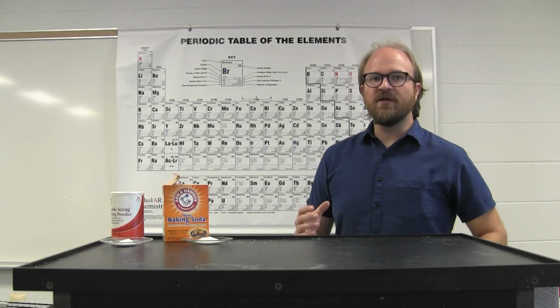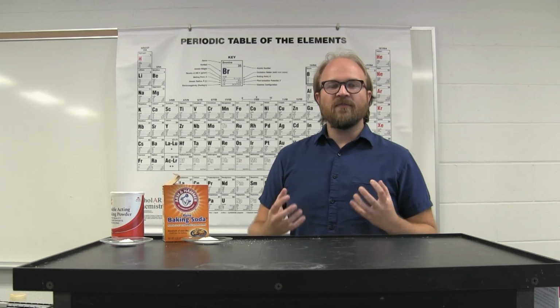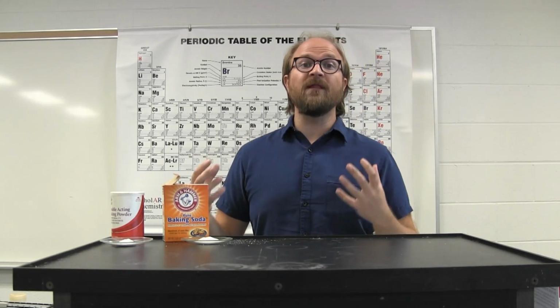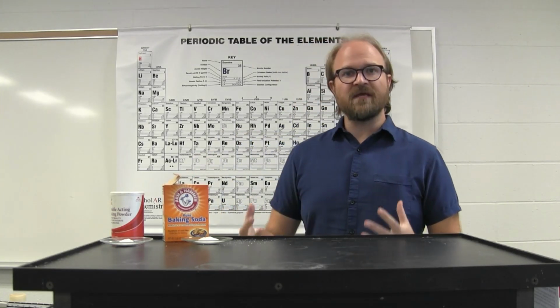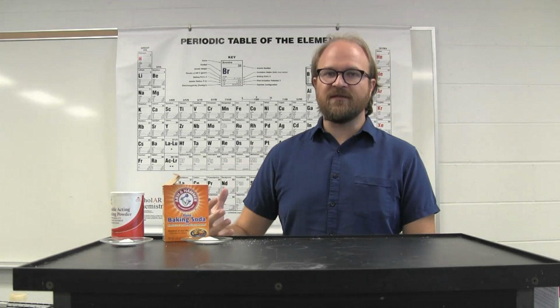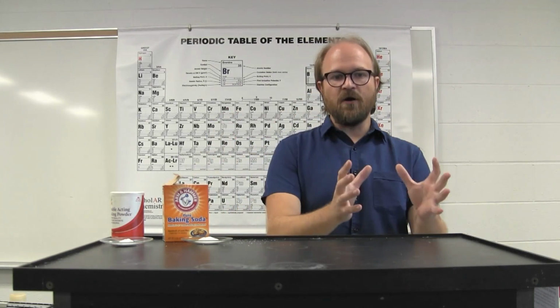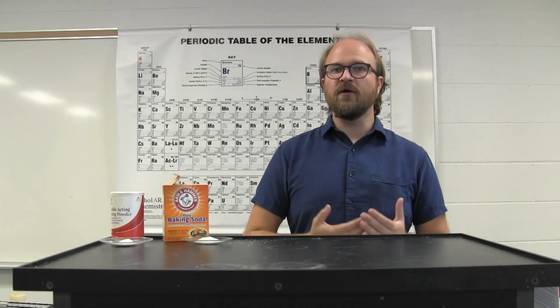Percent composition is used to define the ratio of different components within an impure substance or a blend of something, a mixture. What percentage or what fraction of this mixture is composed of this particular pure compound?